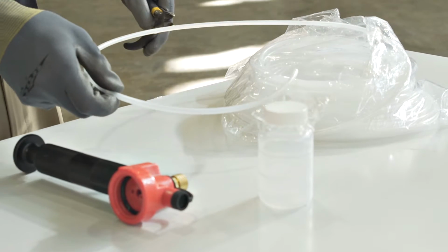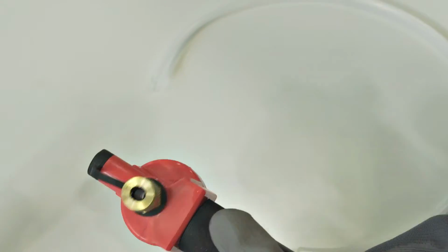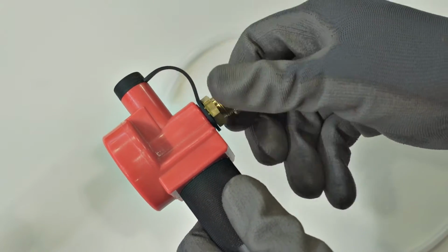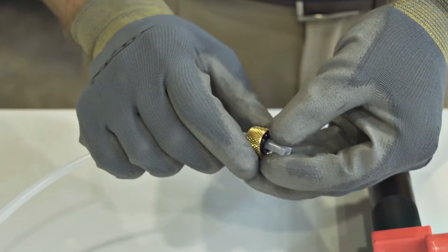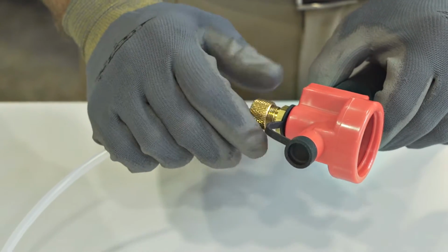It is important that vacuum pumps are used with appropriate tubing. Make sure that new tubing is used for each sample in order to avoid cross-contamination. Using the same length of tubing each time you sample a particular reservoir helps ensure a consistent sampling depth within the reservoir. Aim for 1/3 to 2/3 from the surface of the fluid.